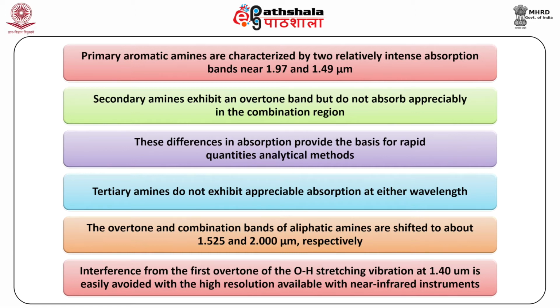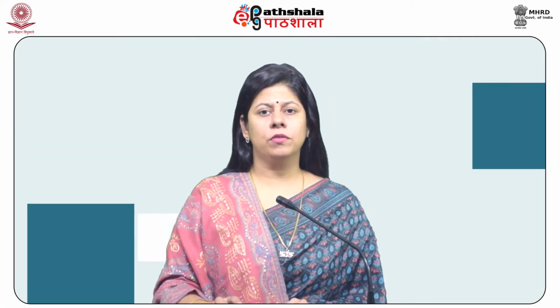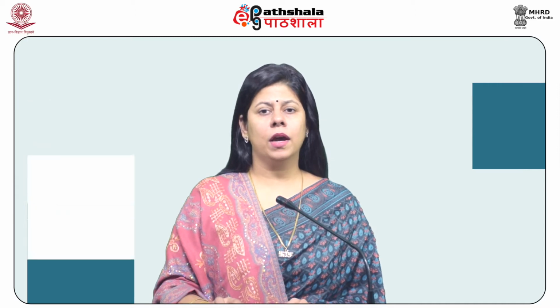The overtone and combination bands of aliphatic amines are shifted to about 1.525 and 2.00 micrometer respectively. Interference from the first overtone of the OH stretching vibration at 1.40 micrometer is easily avoided with the high resolution available with near infrared instruments. Near IR reflectance spectra find wide acceptance in the food and grain industry for the determination of protein, fat, moisture, sugar, oils, iodine number and so on.